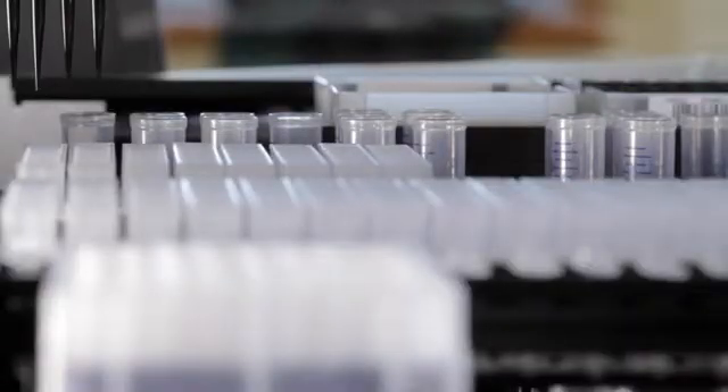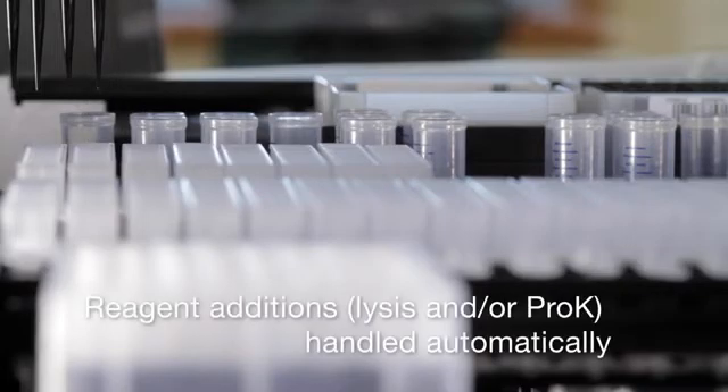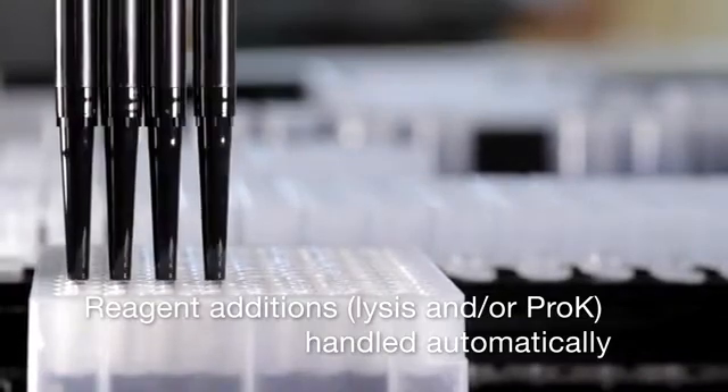Reagents are placed onto the MaxPrep Liquid Handler directly from the Maxwell kits. The liquid handler will add reagents such as proteinase K and lysis buffer depending on the extraction being performed.